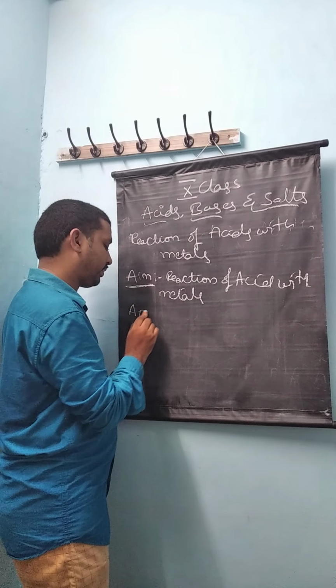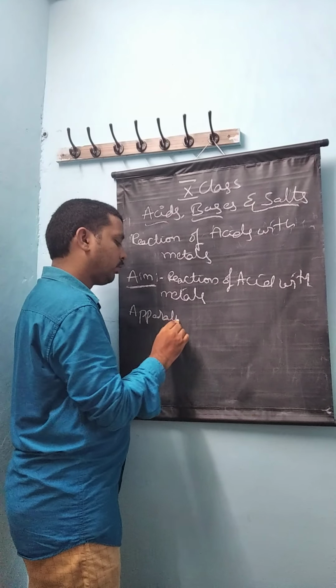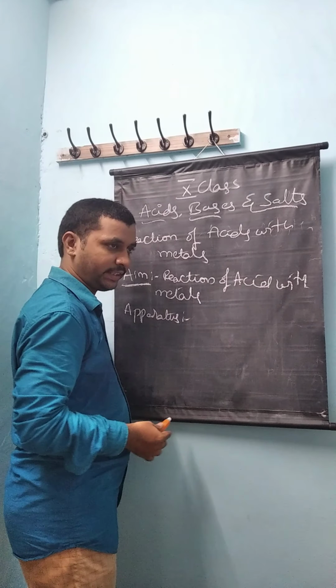Now, apparatus. What are the apparatus we require?